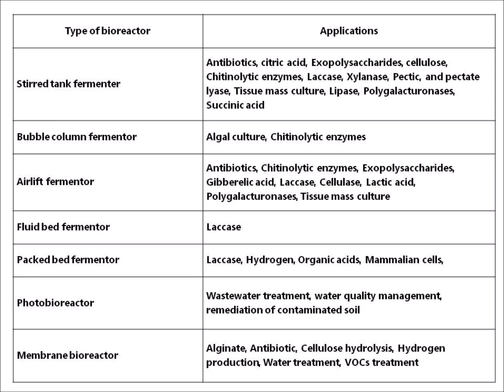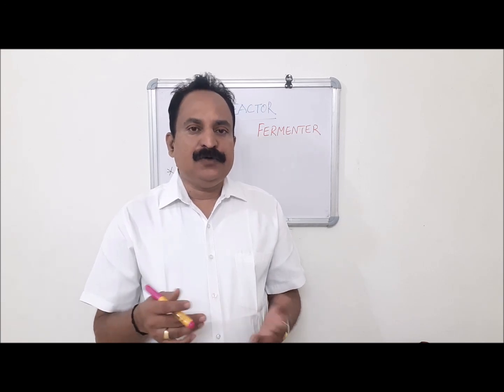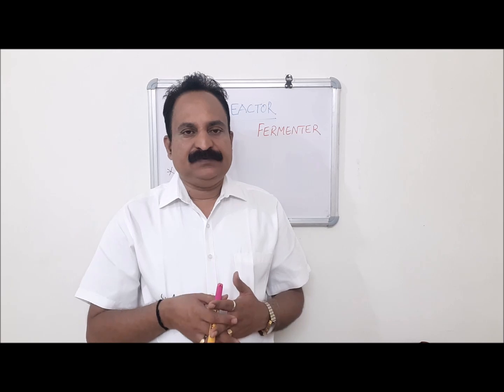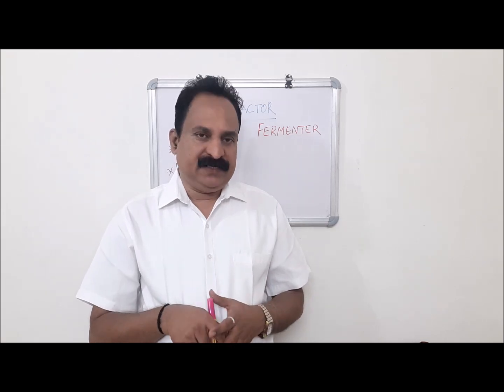Photobioreactor: wastewater treatment, water quality management, remediation of contaminated soils. Membrane bioreactor: alginate, antibiotic, cellulose hydrolysis, hydrogen production, water treatment, VOC treatment. Dear students, I hope you could understand what is a bioreactor, various types, design and its applications.